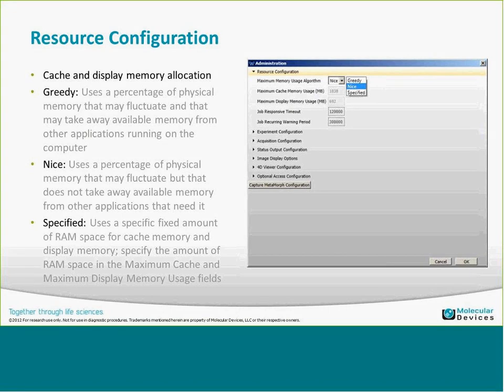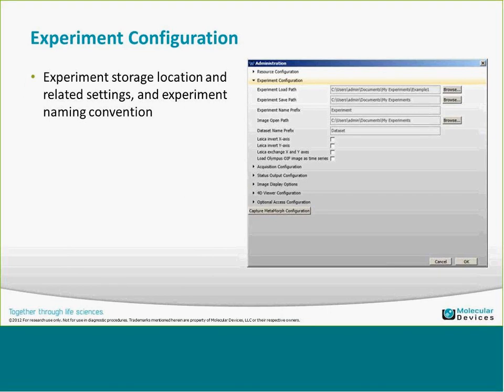I recommend selecting Greedy so the software can utilize as much system resource, memory cache, and so forth as it can during operation — being greedy is a good thing here. The experiment storage locations are the default directories for the experiment load path and save path, plus the image open path. You can set default names for the experiment and the default data set prefix name.